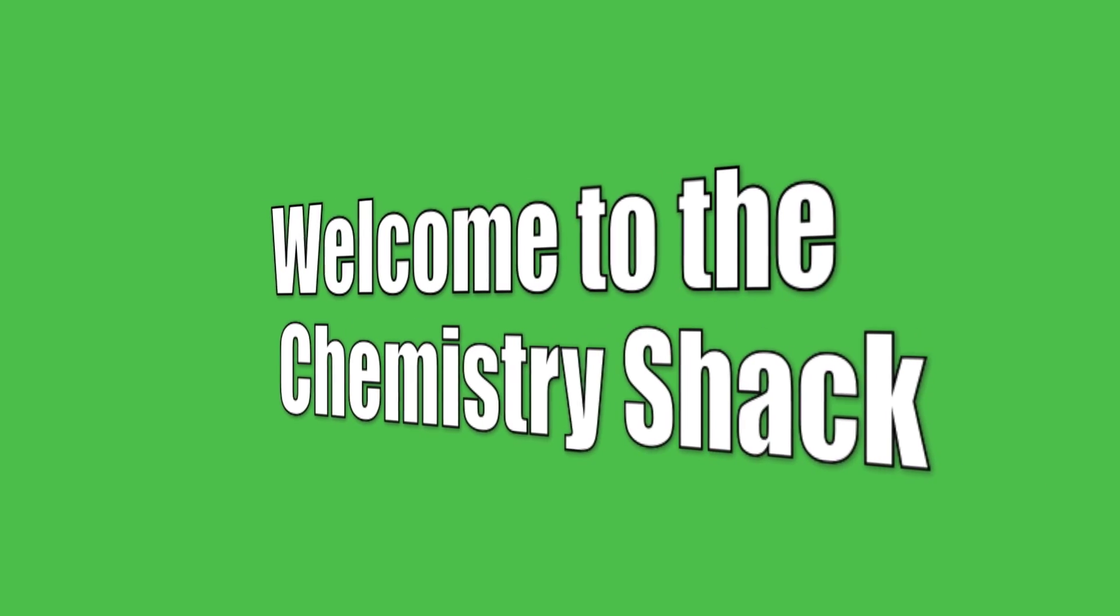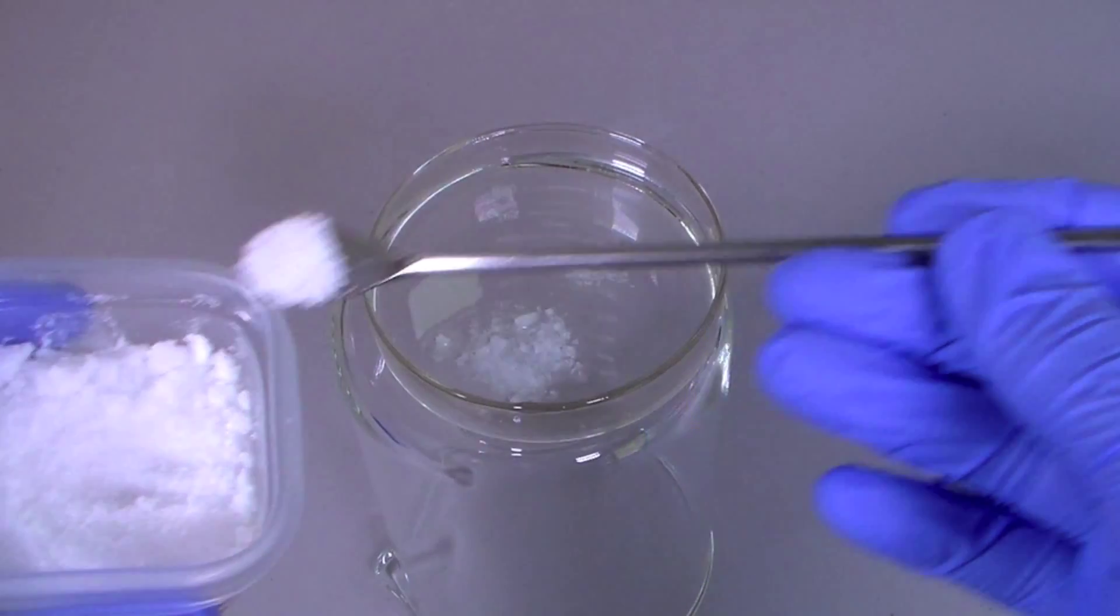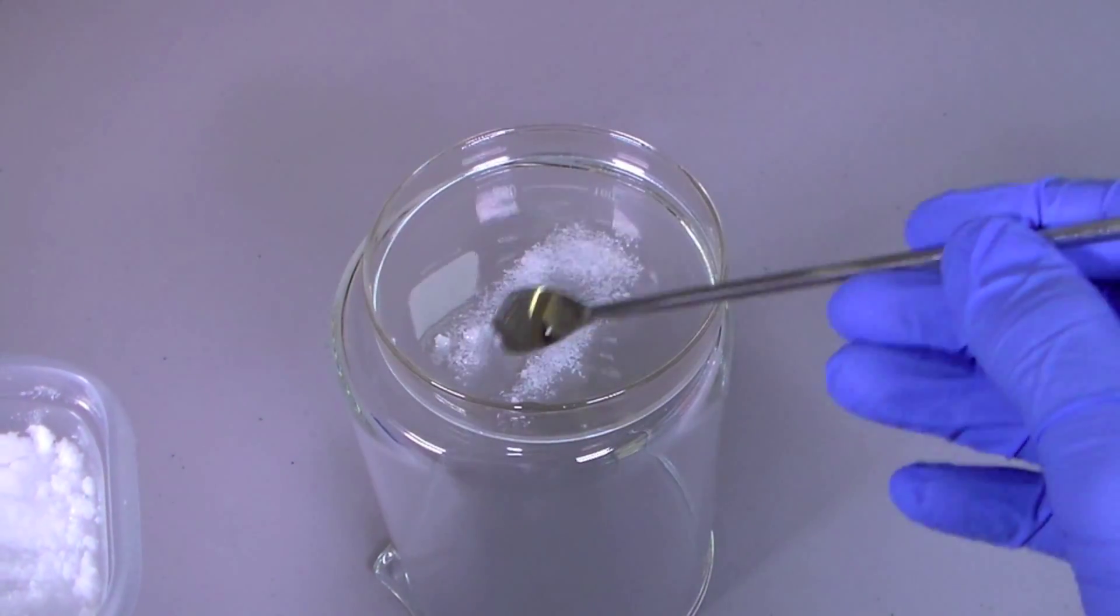Hey guys and welcome to the Chemistry Shack. In this video I will show you how to make green colored fire using the boric acid that we recrystallized in a previous video.